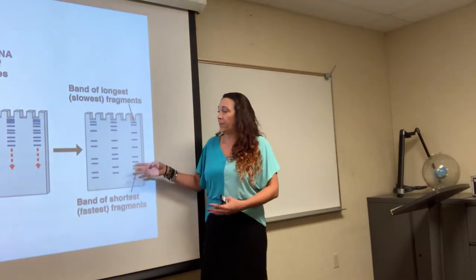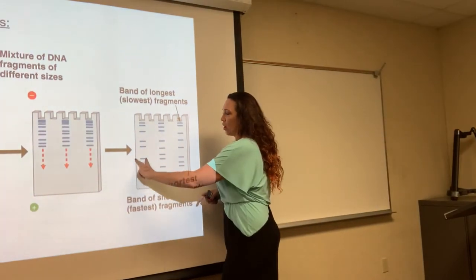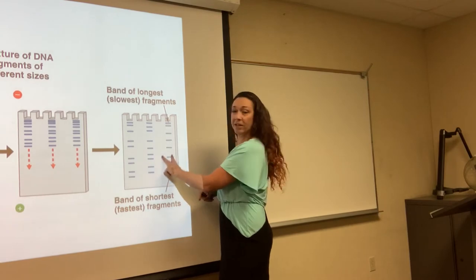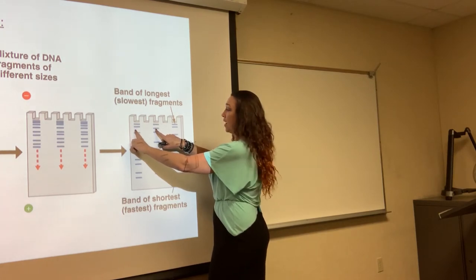What we're trying to do is match up our sample to the suspect sample. We have all of these different bands, and you read it directly across. Say this is our crime scene sample right here. This is suspect number one, and this is suspect number two. If you match these up, the first one matches. Oh, second one doesn't match. This guy doesn't have a match.